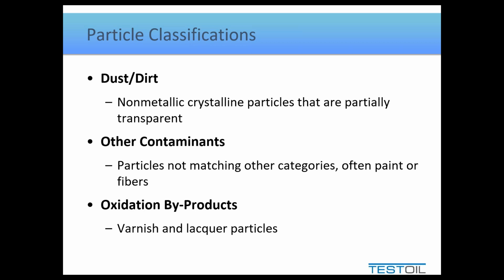So here's the unconventional steps, as I call them, about how to read a report. So step number one, very simple step, sounds easy, it's much harder to execute than you think. Read the whole report. Start reading the report at the top, move from left to right, work your way from the top down to the bottom. Don't skip anything. And you'll see why I emphasize this, because a lot of people just jump immediately to the highlighted values and they're missing the bigger picture.